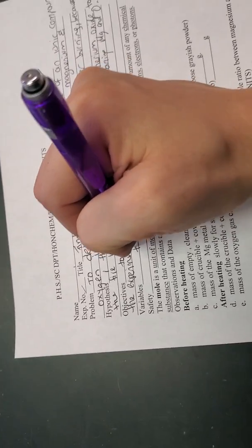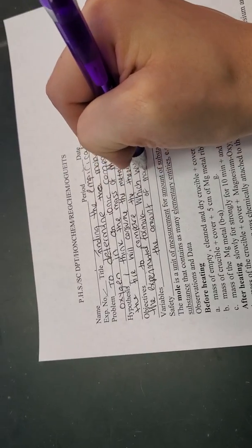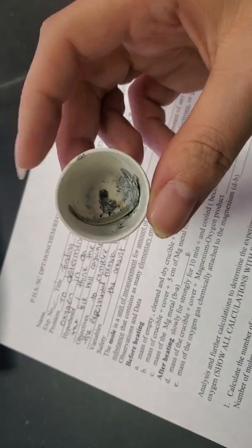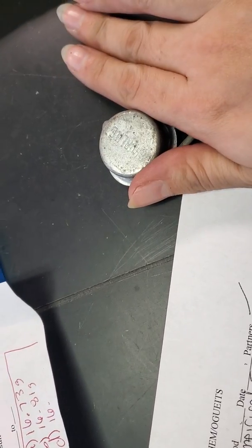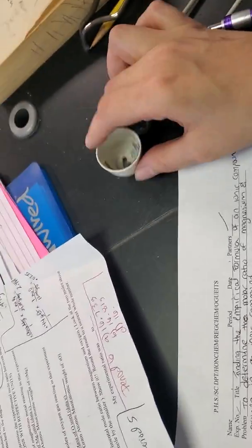So, the variables in this experiment is the amount of magnesium, because let's say that I put in this little teeny tiny strip of magnesium. It's going to take a lot less time to heat up or burn this teeny tiny strip than it would if I put in maybe a chunk of magnesium the size of this, right? If I tried to react a chunk of magnesium like that, it would take a lot more time than a chunk of magnesium like this. So the amount of magnesium is definitely a variable to consider.